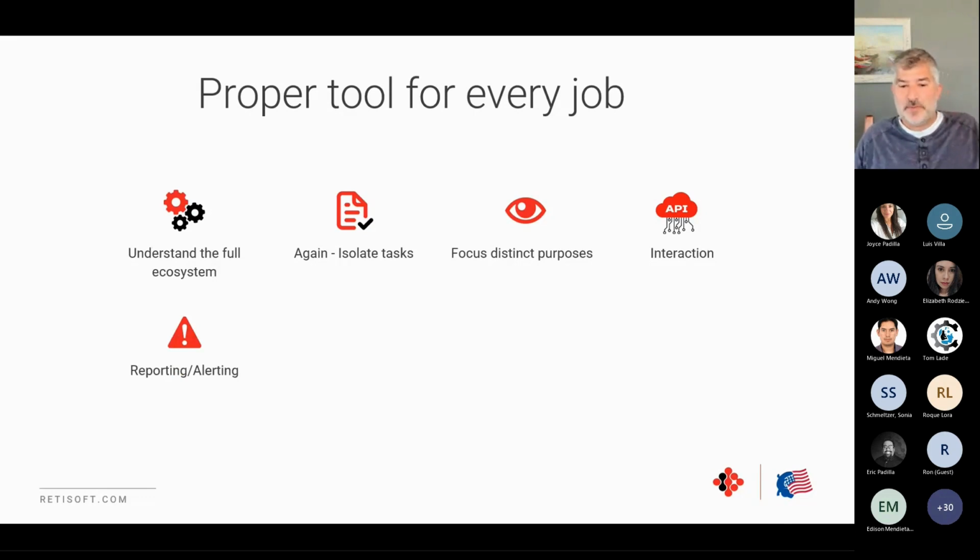While the results of the experiment are ultimately the data we care about, there are thousands of other data points going on in the process as well that can affect those results. As it is, the scientific process dictates that how you achieve those results is part of the results. It's part of that proof and validation.